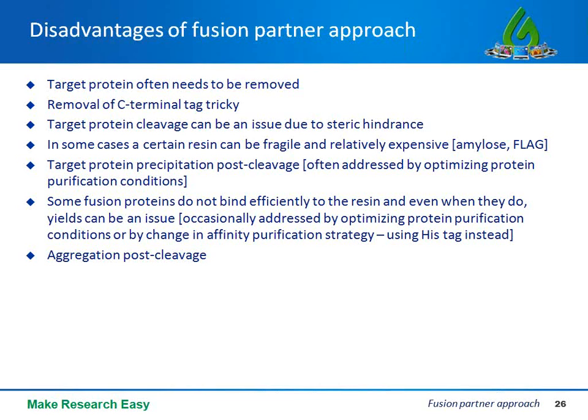Now there are of course ways to address these problems during construct design and purification, but one thing to consider would be to leave the tag on, and this again depends on the application of your target protein. If you can still derive biologically relevant data from using tagged soluble protein, you should consider that approach instead of going through the motions of trying to cleave off the tag and then struggling to keep your target in solution.